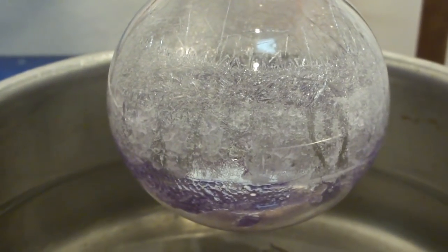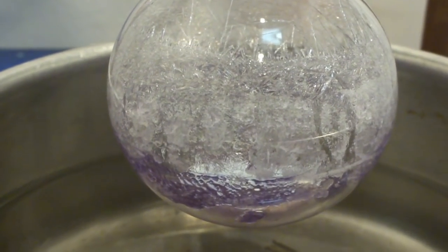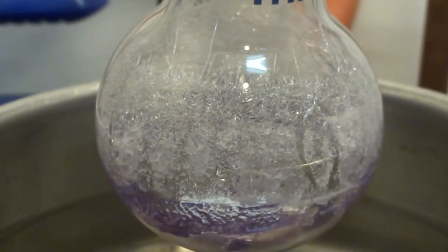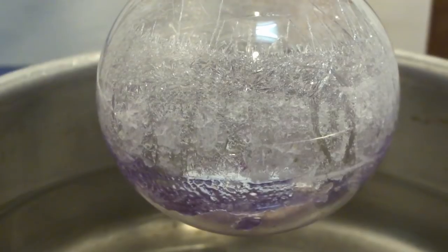And here's the residue in the boiling flask after it has cooled down to room temperature. Again, we're just going to add another batch to this and distill some more out of this.